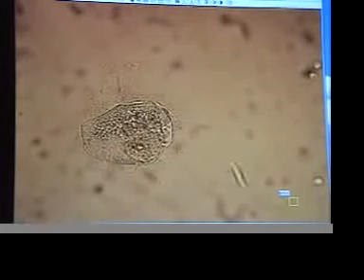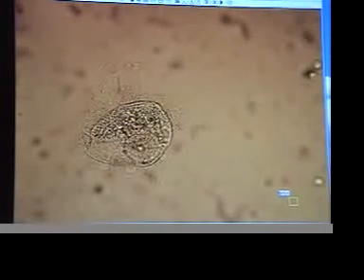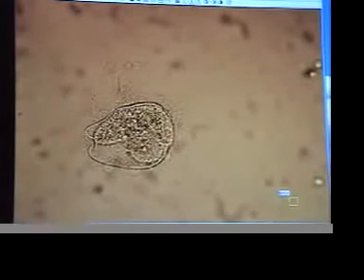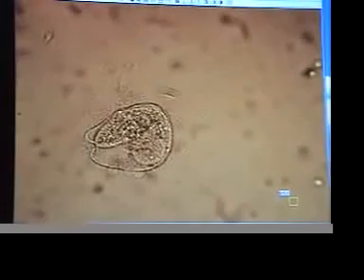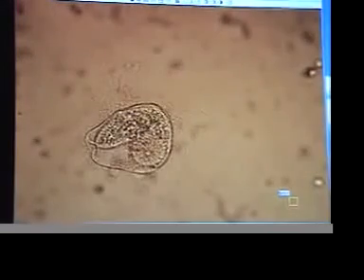Change the focal plane a little bit and see what happens. We might experiment a little bit with the DIC filter. Let's see if we could do that quickly. And here comes the last part of the DIC.